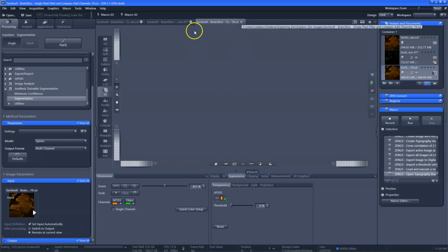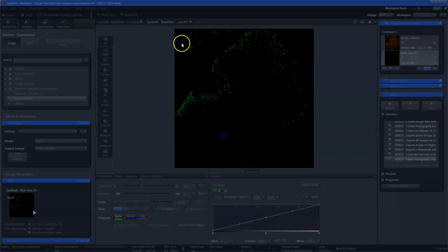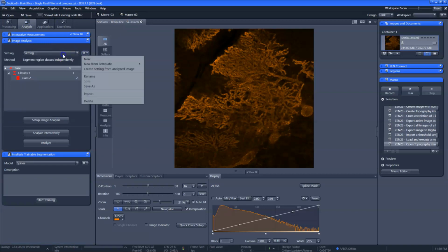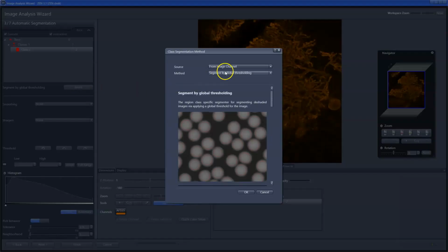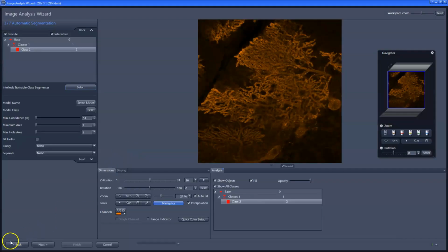Now that I'm happy that it appears my Intellesis rule set is working nicely, I will proceed to my image analysis, where we'll do the actual data reporting. I've created a spine analysis configuration that I will now set up for use with the classification rules that we have just trained. For this, I need an image open, so I'll open my original Z-Stack image used for training.